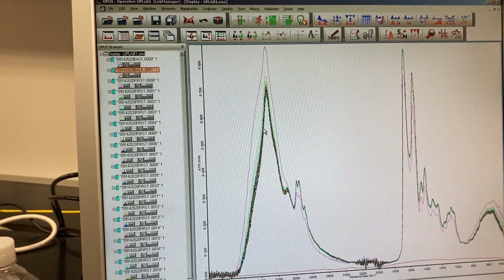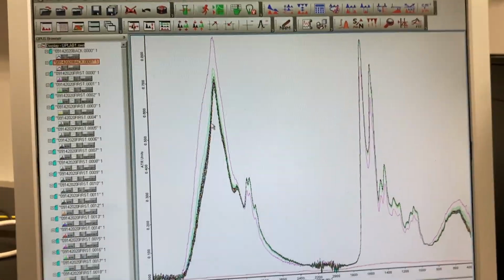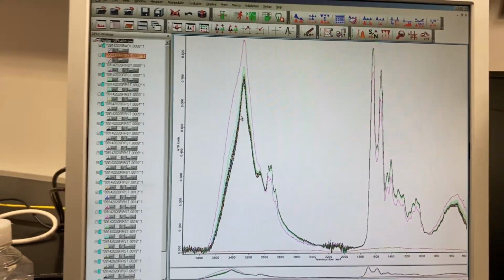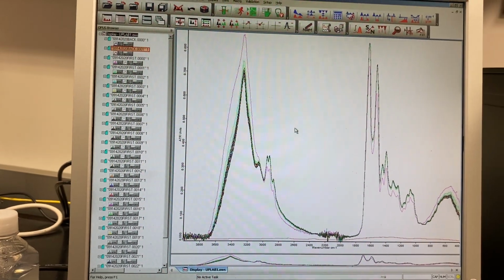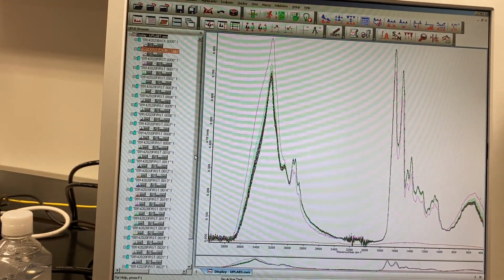Okay, sorry, the battery is finishing on my phone. So in this video I will show how to do the data analysis, if the battery remains for a long time.